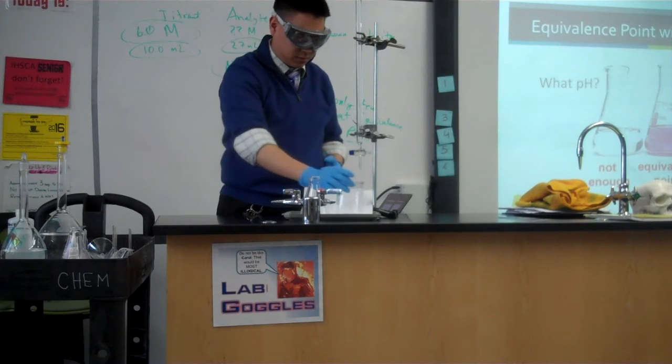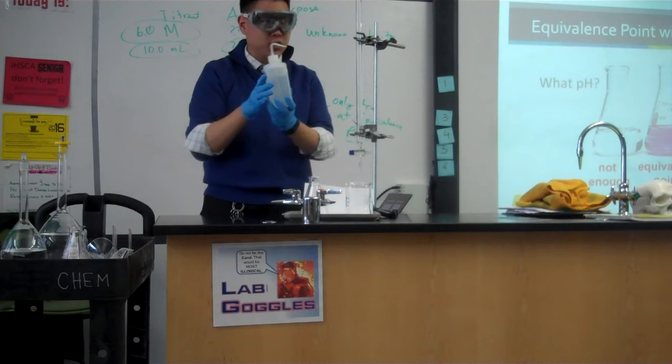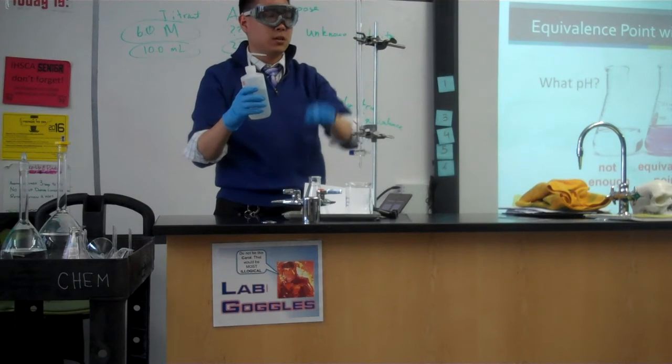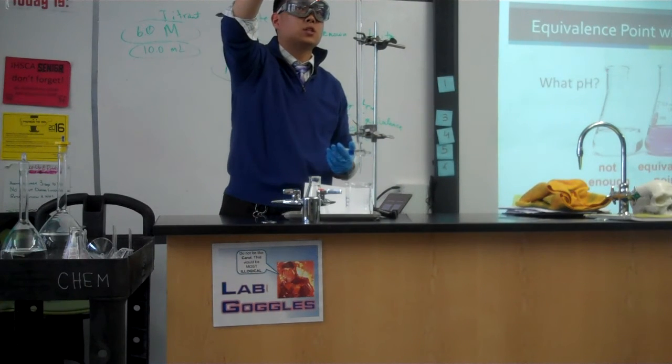So, you're going to take a beaker. I'll have to share some squirt bottles. This is filled with distilled water, pure water. The point is, so we clear this out. Maybe someone in the previous class didn't clean it completely. You're going to want to spray it in here.